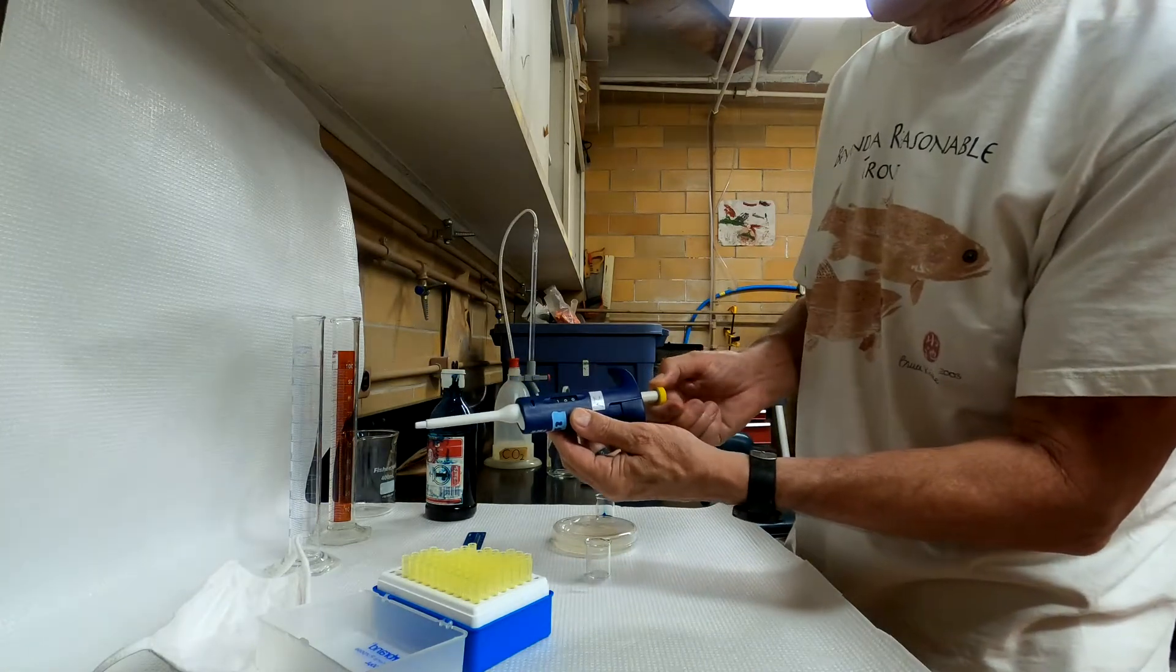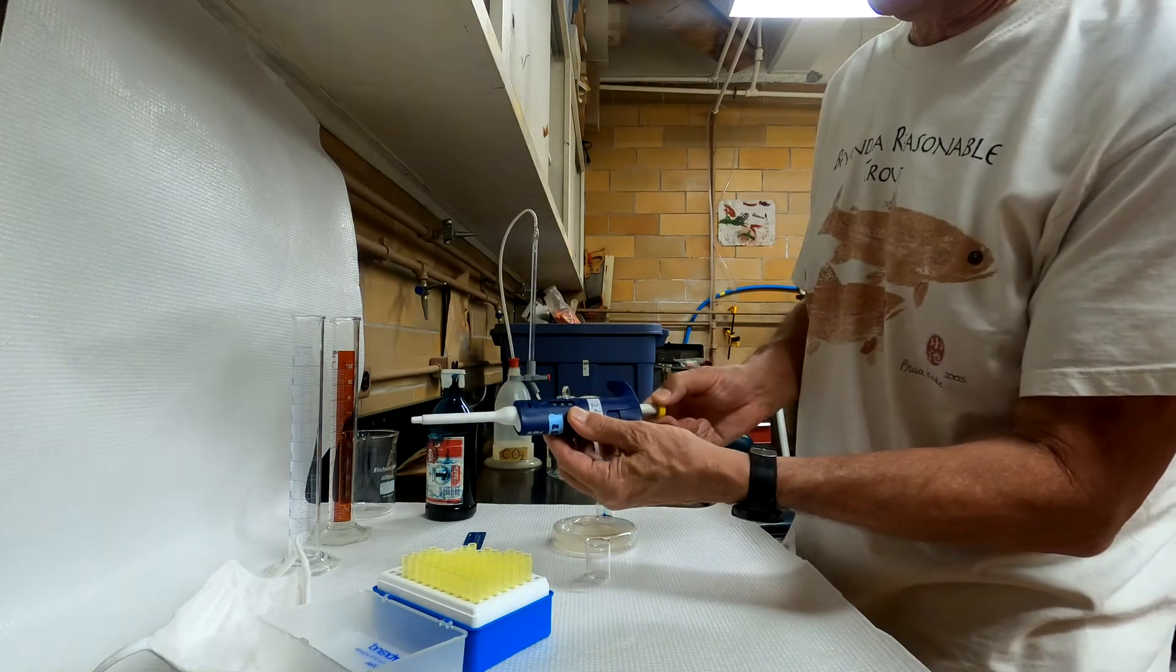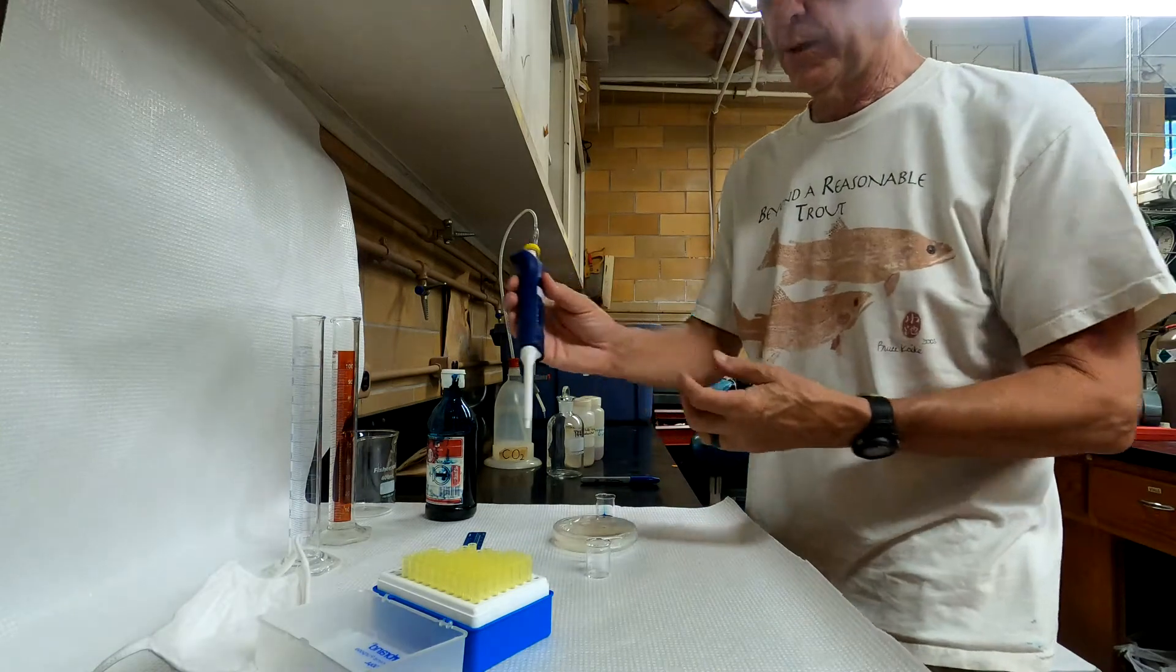We set the volume first by turning this knob, and it's set to 200 microliters, or .2 mils.